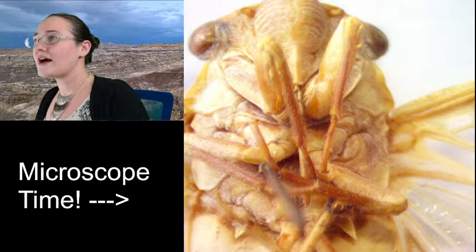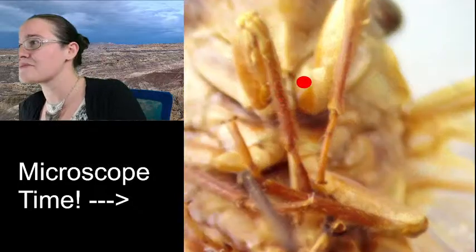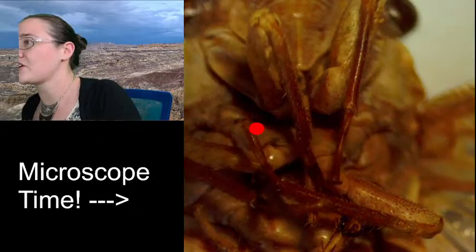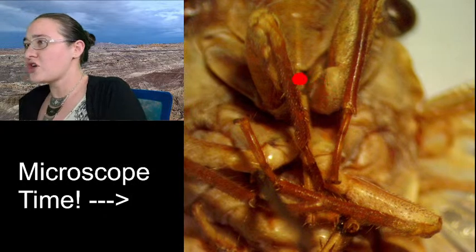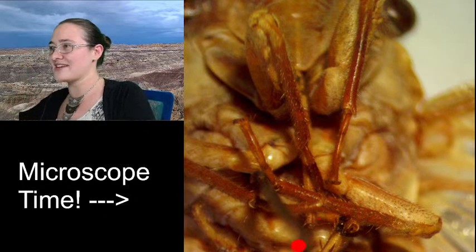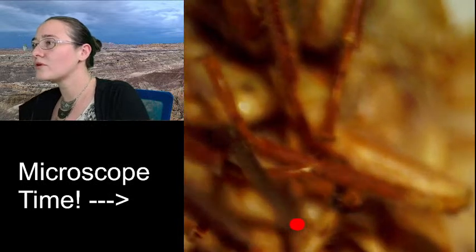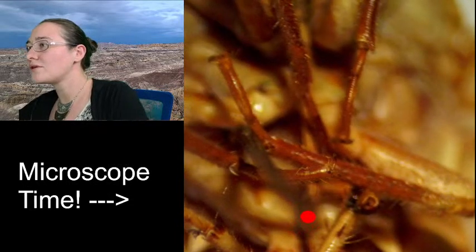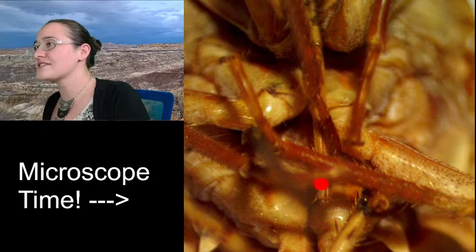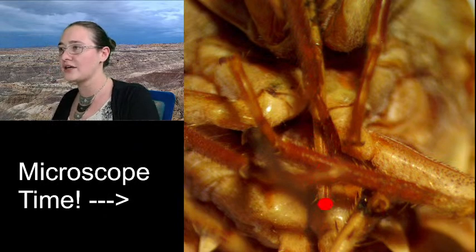It starts, so this is kind of the base, the pump part of the mouth part, and then coming out from there, the legs are kind of in the way, which is why I hadn't done this. Maybe if I darken it a little bit. Maybe the contrast will help. So the mouth does come right about through here, so you can almost see the straw, but you definitely can see the end of it right here. Right there. So this is where that mouth part ends. So it looks almost like a straw, and it goes all the way along here.